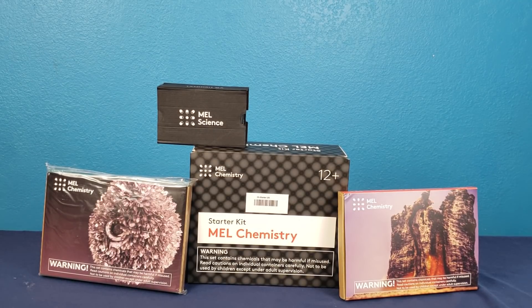So here's what came in our box. We got the starter kit, the virtual reality glasses, the tin experiment, and the chemistry of monsters kit. That's the one we're going to be doing — it's the one on the right.